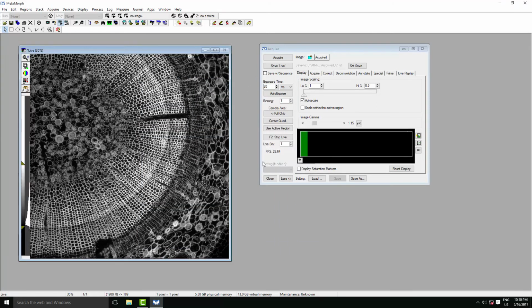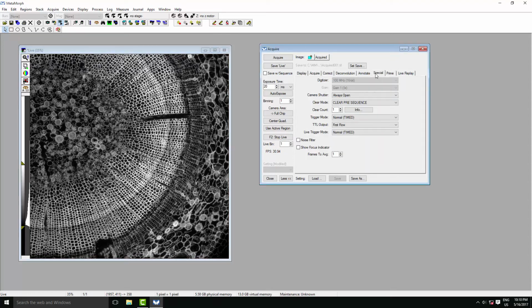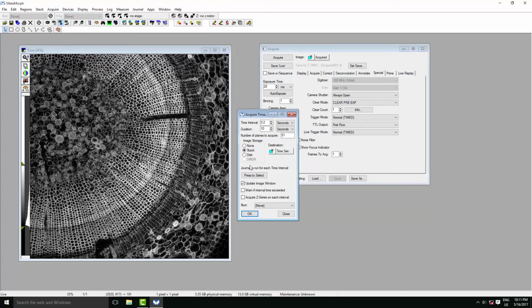If we want to do a time lapse, there's one setting that you need to change, and then change back if you're recording a movie. That's called the clear mode, and for a time lapse you want to choose clear pre-exposure. Whereas for movies and for normal camera use, you want to choose clear pre-sequence. Once we've picked clear pre-exposure, we can go to the Acquire Time-Lapse menu choice. And here we can specify the interval that we want between frames and how long you want to record for.